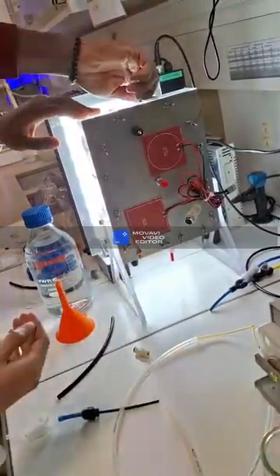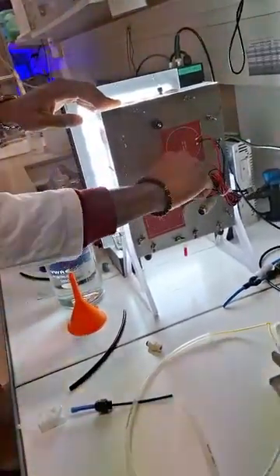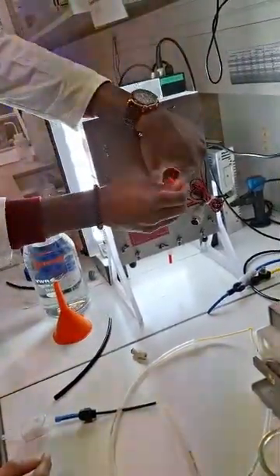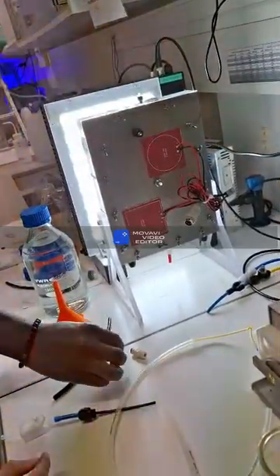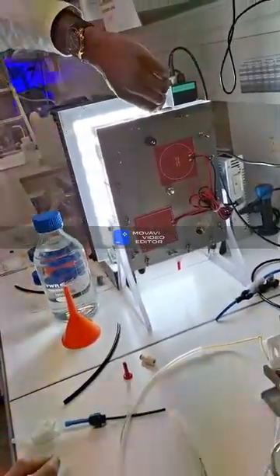No, no, no. We will change it later. Don't worry. So outlet is right here. So you will plug a pipe here, just to collect the culture.